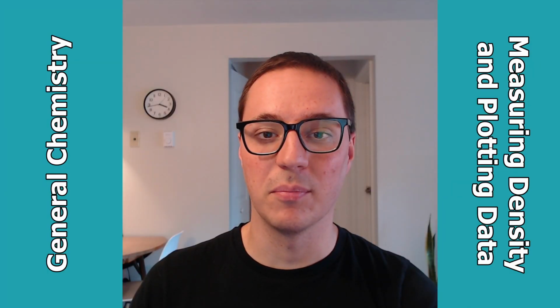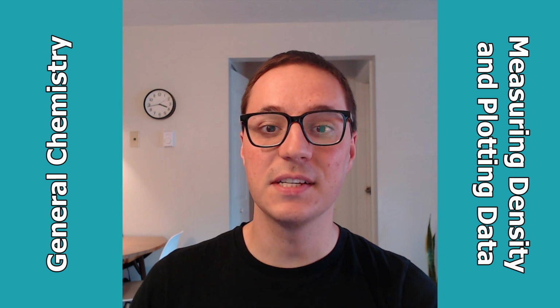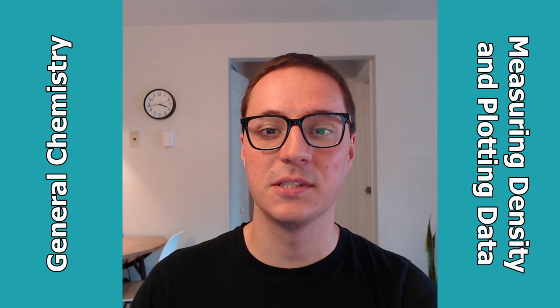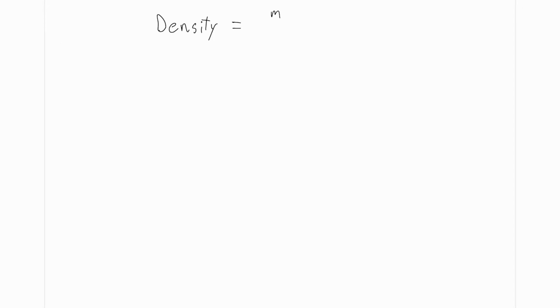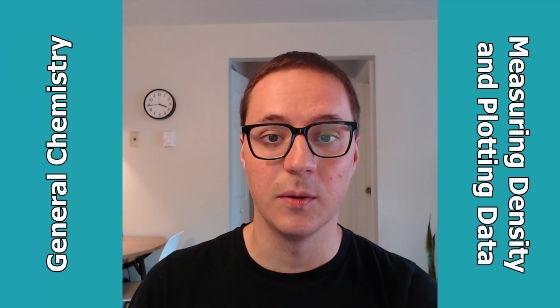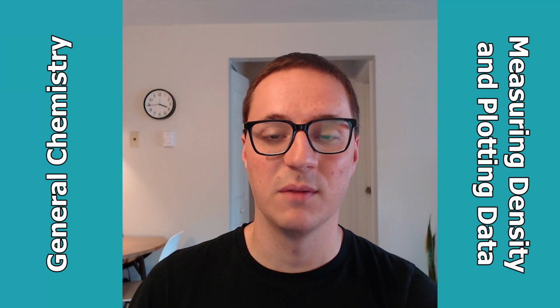Density is an important property of all materials. In this experiment, we'll use density to demonstrate the utility of plotting data. Density is defined as mass over volume. Typically, we use units of grams per milliliter, but any combination of mass and volume units is valid. We can find the density of a material by measuring both the mass and volume of a sample of it.